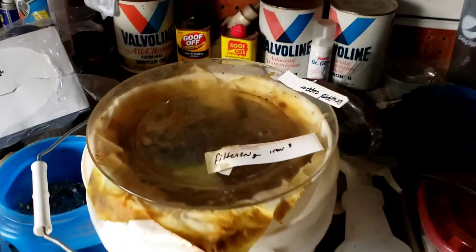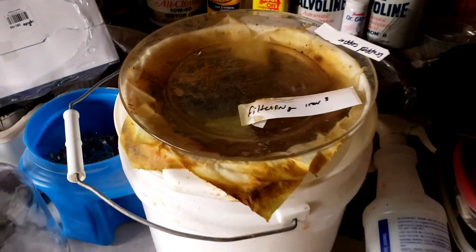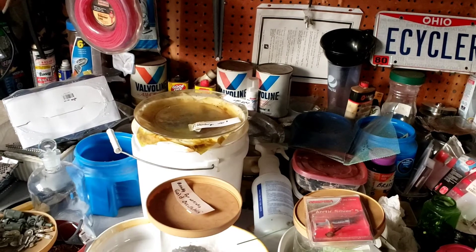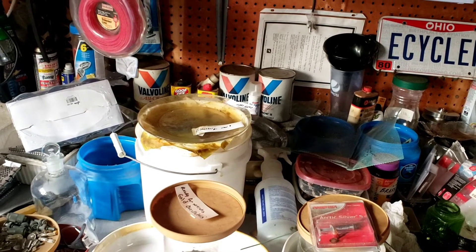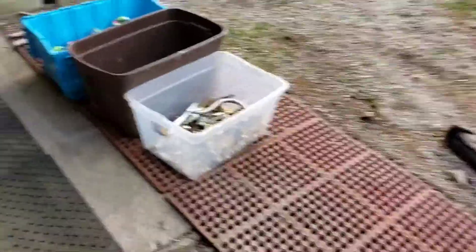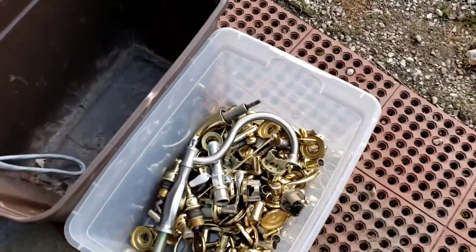This is just filtered-off copper. I'm gonna hit that with a torch and then I may send that up to EYS Mike to drop the copper. I showed you the brass a few different times.